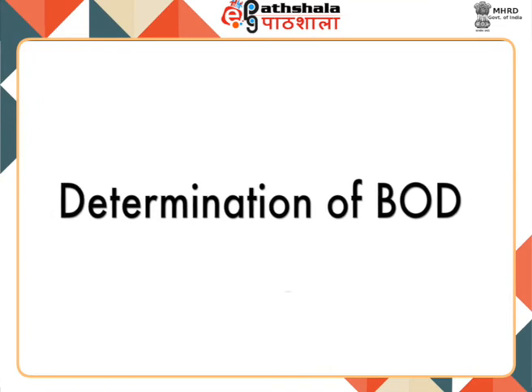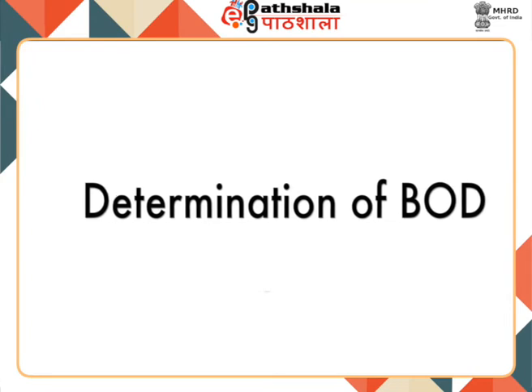Now, you will learn the method for the determination of BOD. The BOD test relies on a measurable depletion of DO over a specified period of time. The BOD test is used to measure waste load to treatment plant, determine plant efficiency, which is in terms of BOD removal, and control plant processes.